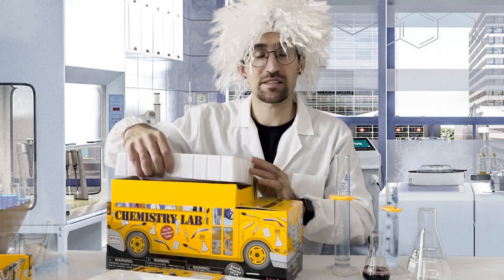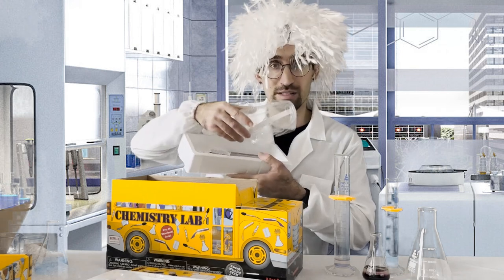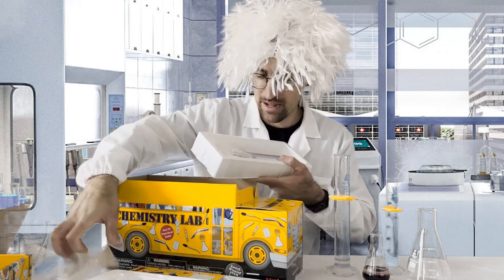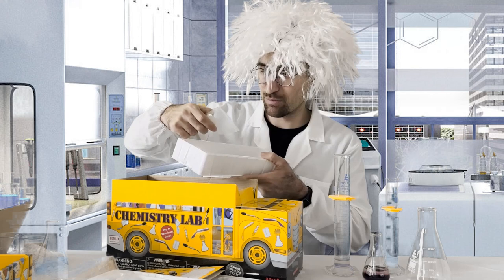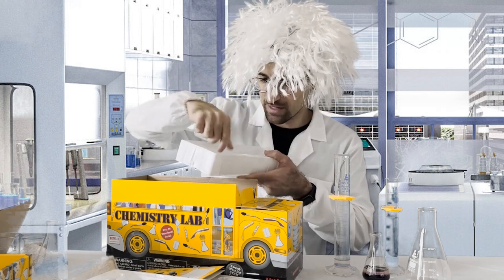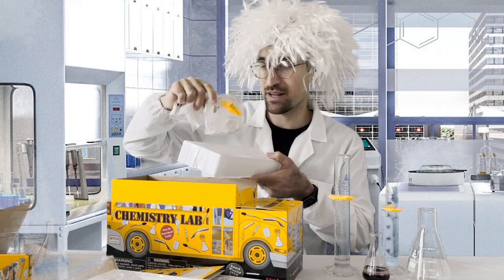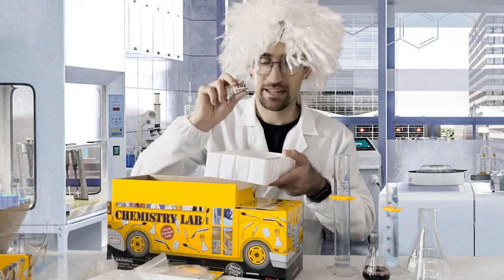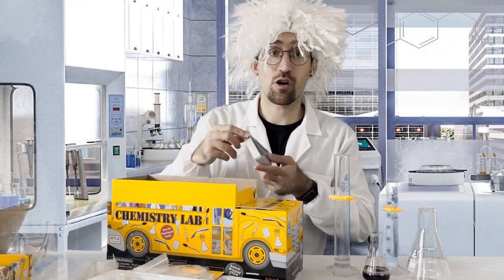That brings us down into the lower levels of what's included. Something I really like about this Scholastic kit is how comprehensive it is. It also includes a nice set of goggles to help keep your child safe during experimentation — we don't want to get any chemicals in their eyes. It also includes sodium tetraborate, a little piece of wax, string, chromatography paper, a small baggie, pH paper, a balloon, and some clay for certain experiments.